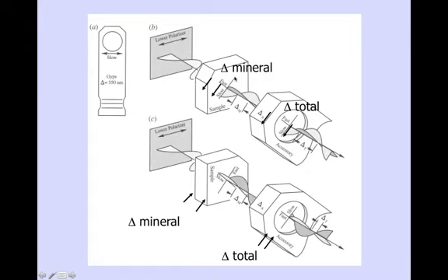And if you've got the slow ray in the mineral, look at my pointer there, parallel to the slow ray in the accessory plate, you're going to add to the retardation and you'll get an interference color that is to the right on the Michel-Levy chart. If, however, you have the fast ray of the mineral, I'm pointing to the lower part of this diagram, parallel to the slow ray of the gypsum plate, then you're going to get a reduction in the total retardation, and the interference color that you see will move to the left on the Michel-Levy chart.